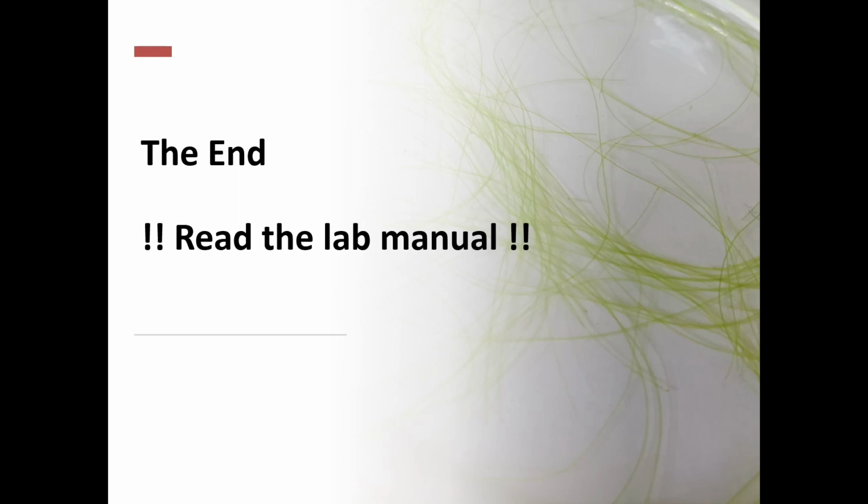In conclusion, today you have learned two methods for measuring the size of specimens. Please read the lab manual for further details.